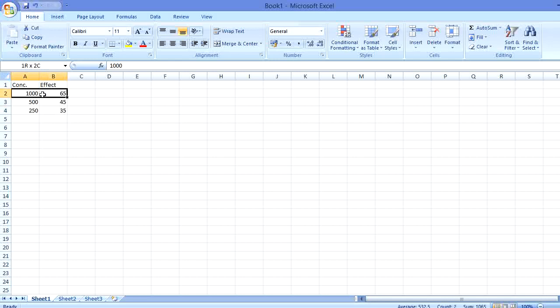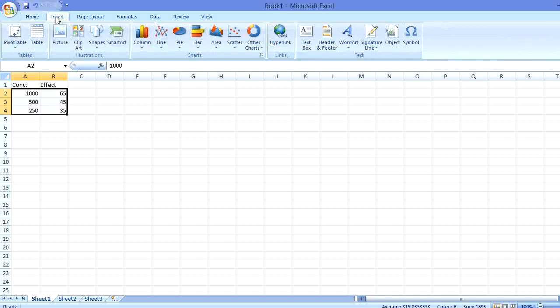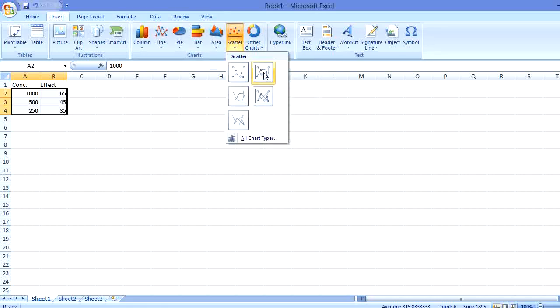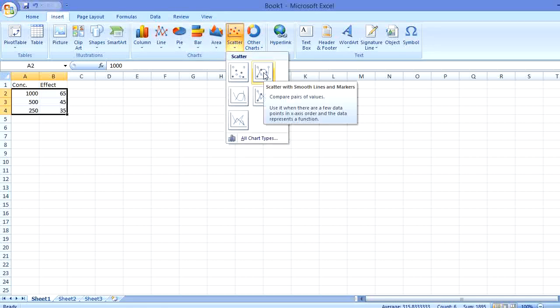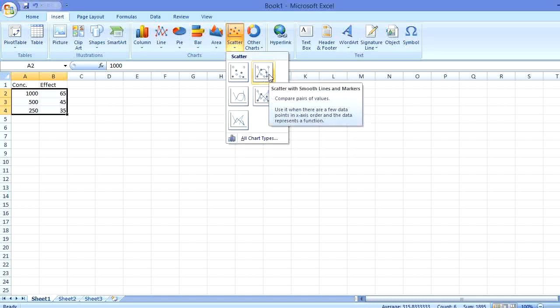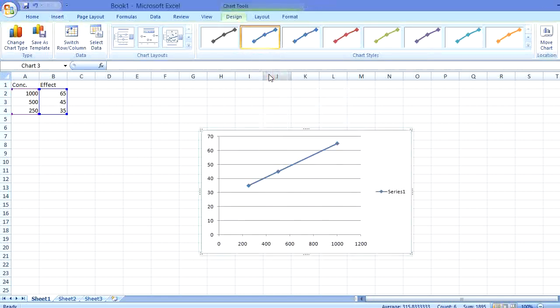We will simply draw a graph. We will go to Insert, then this scatter diagram, and then the second option — Scatter with Smooth Line and Marker. We will click this and we will get a graph.